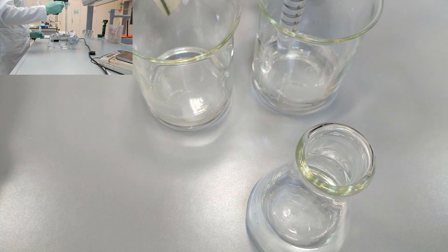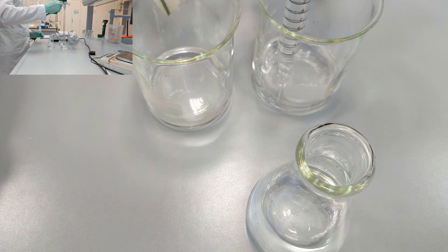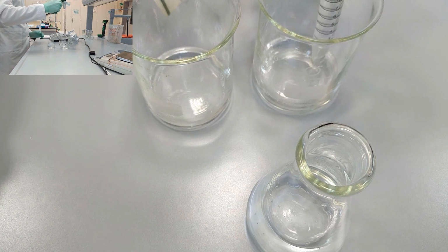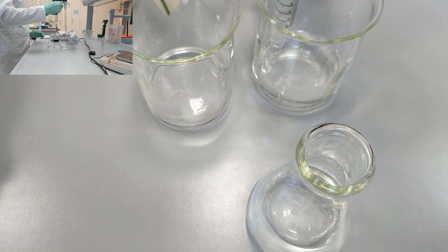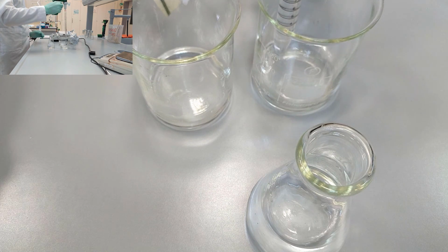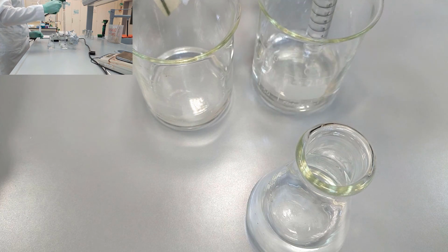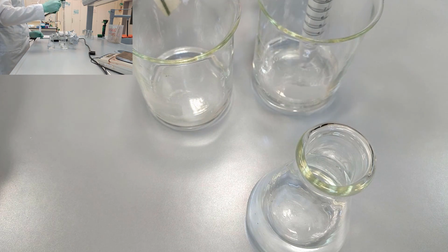Be careful not to bring the bubbles, because with these bubbles, and we show it intentionally, you can lose the substance, the solute, when it can really create the foams.